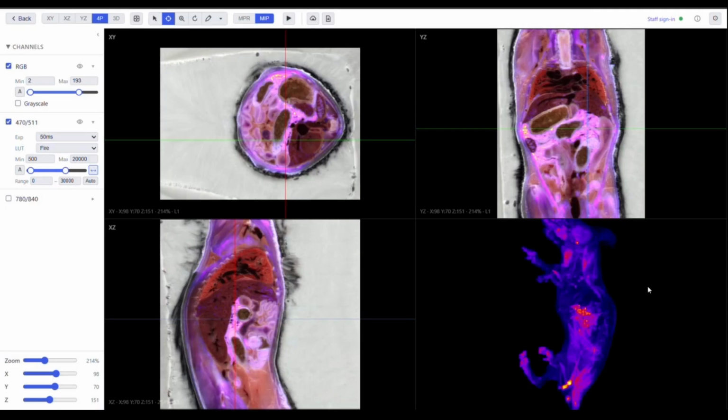And that covers the core features of the EMIT CFT web viewer. A simple workflow to remember is: start with the anatomy to orient yourself. Select and optimize the fluorescence channels you're interested in. Explore the signal through different slices, planes, and 3D views. And once you have a setup that works well, save that view so it's ready the next time you return.